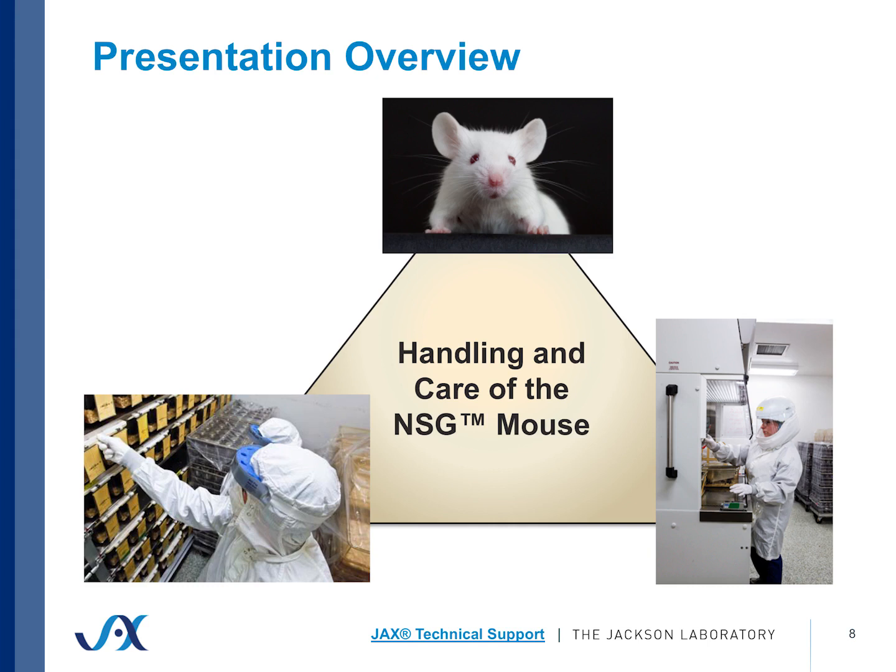The second functional unit here is the people. So, anyone who comes in contact with the mouse, it could be the researcher, it could be the caretaker, it could be the veterinary staff, anyone who has some kind of interaction with that mouse or plays a role in how that mouse is cared for in your facility. Cage washers, technicians, laboratory staff, anyone who might be within that realm of that mouse room has an effect on the mouse. And how are they going to be interacting? What kind of precautions are in place to protect them or to prevent the transmission of potential mouse antigens, pathogens or opportunists into that mouse? What kind of regulations or considerations should you have in place? We're talking about the people that are there.